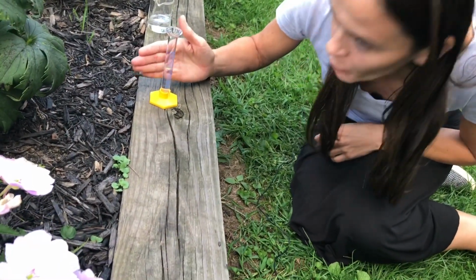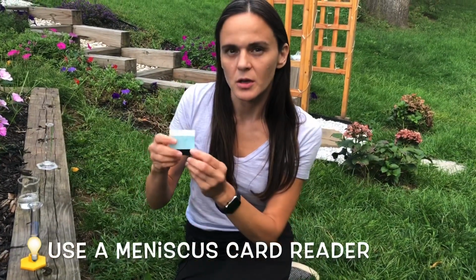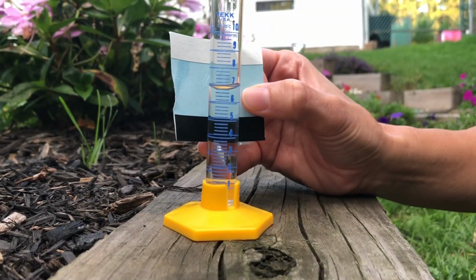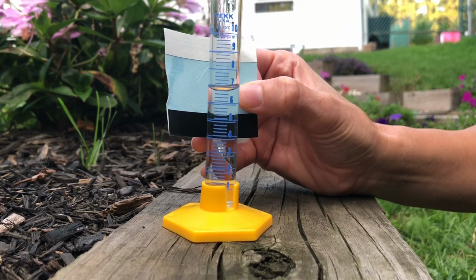To help you with the reading, you want to use something called a meniscus card reader to help you see the meniscus a bit more clearly. Okay, so now let's see what the volume of the water is.